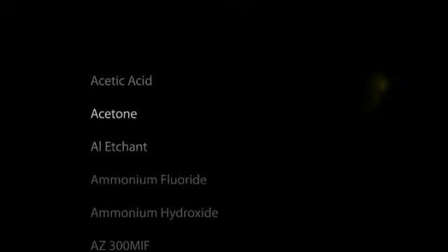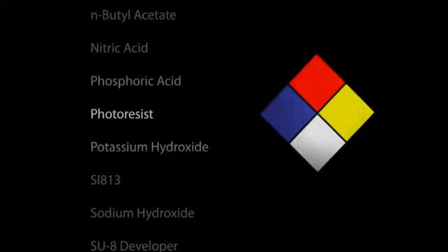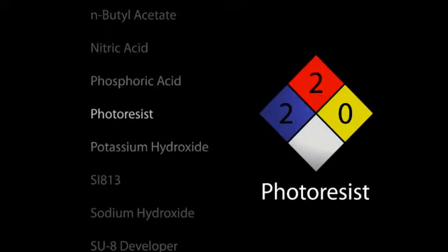There are also solvents like acetone or methanol, whose fumes can cause dizziness and are extremely flammable. Even chemicals like photoresist, which are not a strong acid or base, can still cause permanent liver, kidney, and nerve damage with long-term exposure to the fumes.